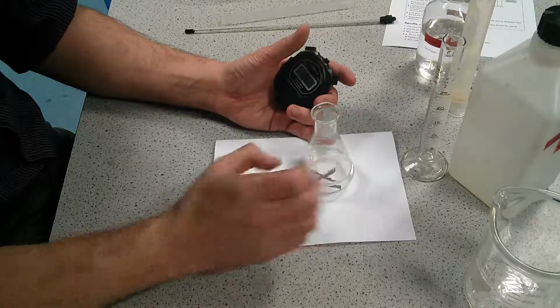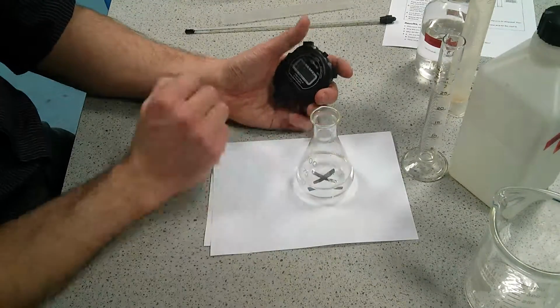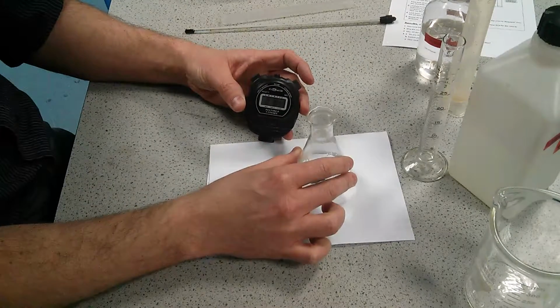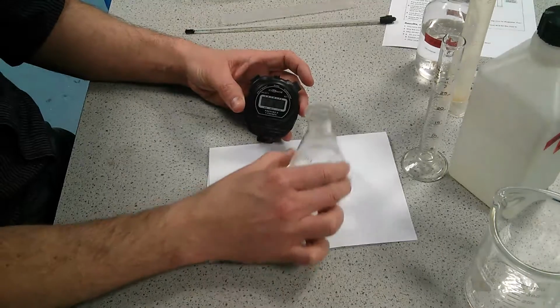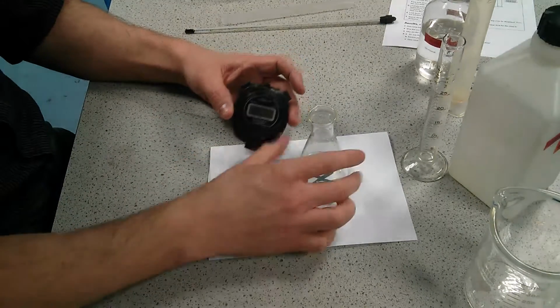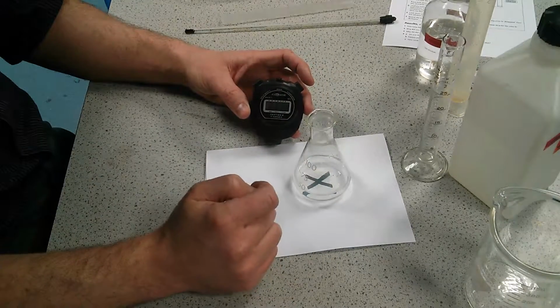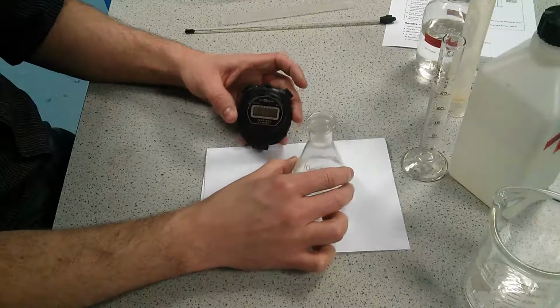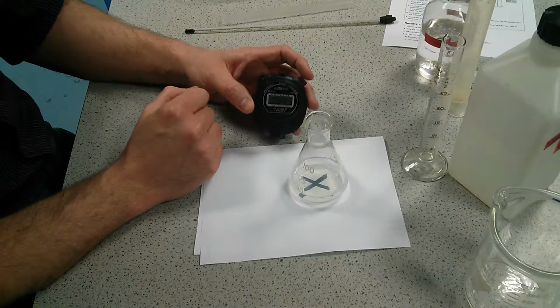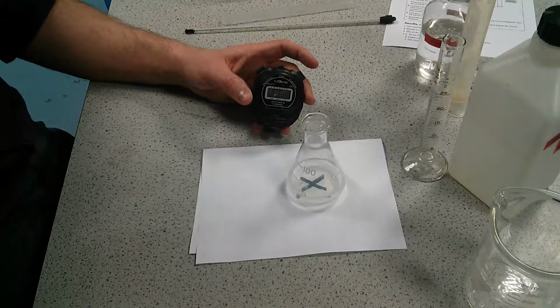We keep stirring like so. And we're still timing. And what will happen is a solid will start to form and you will not be able to see the cross through the top of the conical flask. So we'll keep going. It's starting to go cloudy now.